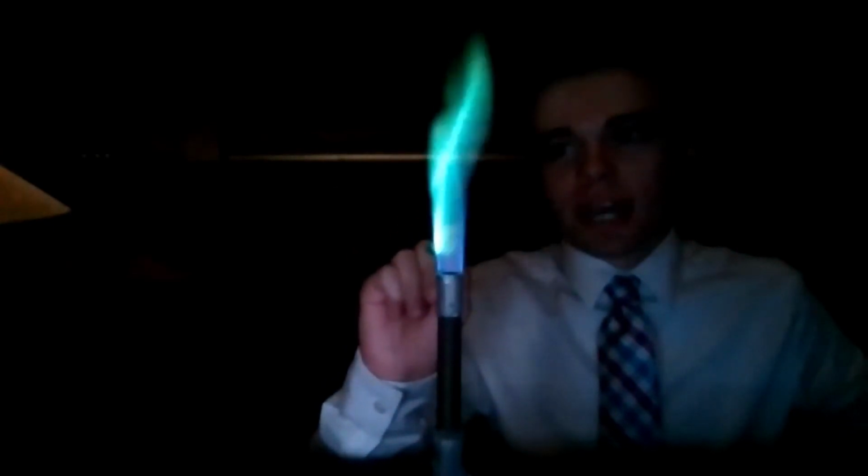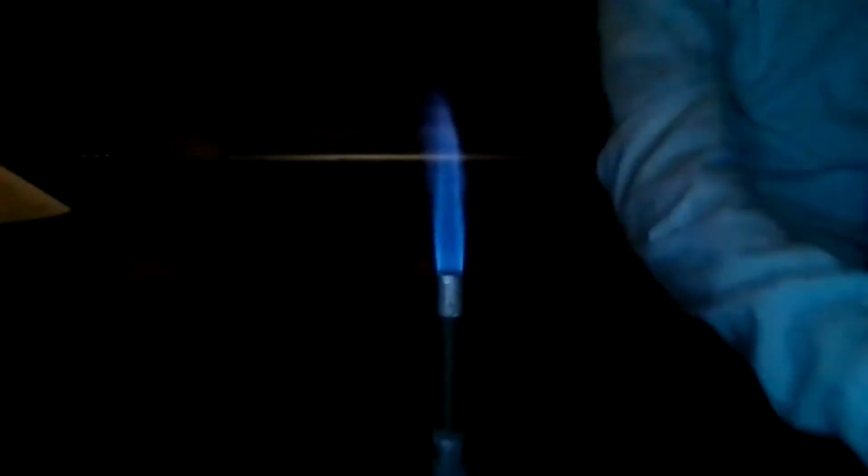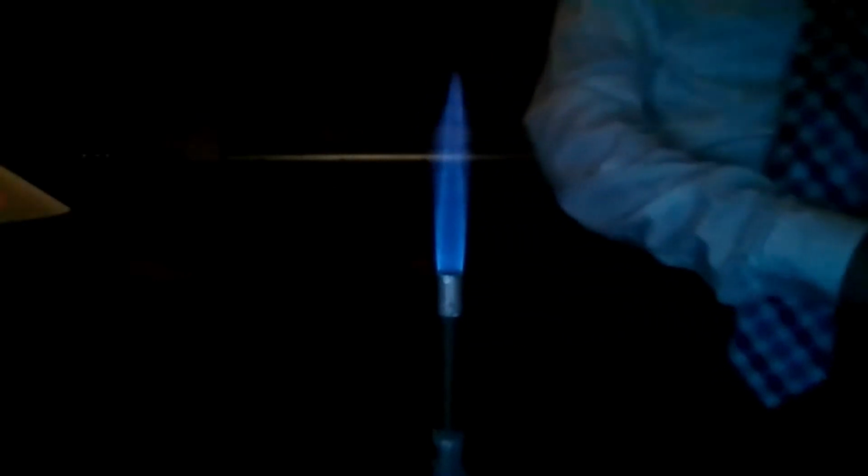Okay, so now it's time for the best part. For the unknowns, I'm gonna randomly pick two of the ones that we have up here. And what I want you to do is, I'm gonna burn them. I'm not gonna tell you what it is. I want you to write down what color flame it is, and then I want you to try to determine what the unknown is. So for unknown 1, I'm gonna put that one in first.